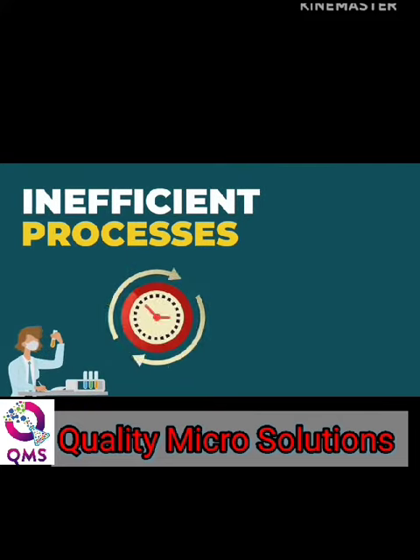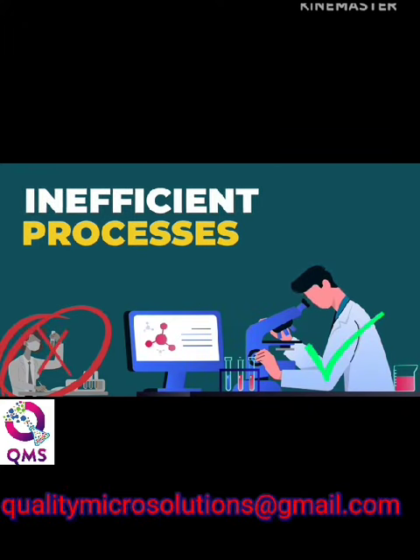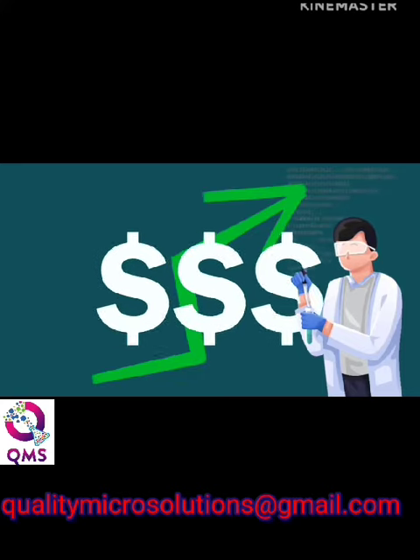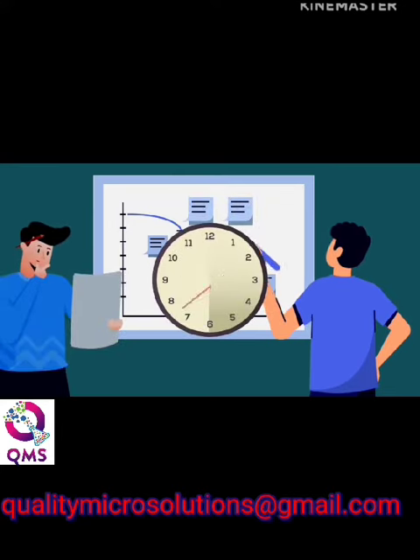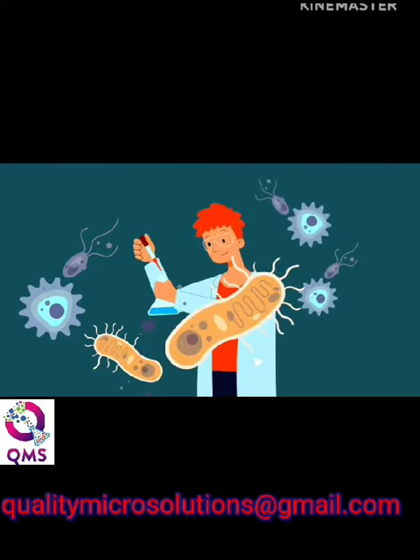Data has to be carefully logged into systems to start identifying non-value steps in their process. Inefficient steps can be very expensive, which can drive environmental monitoring services to be higher than normal. For example, teams could duplicate data, spend too long verifying information, or they may suffer a major setback if there is a bacterial break in the area of testing.